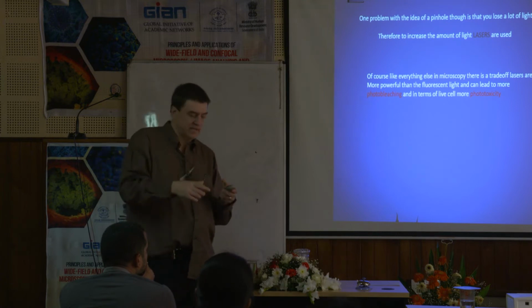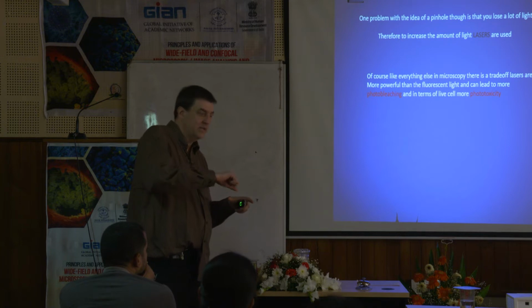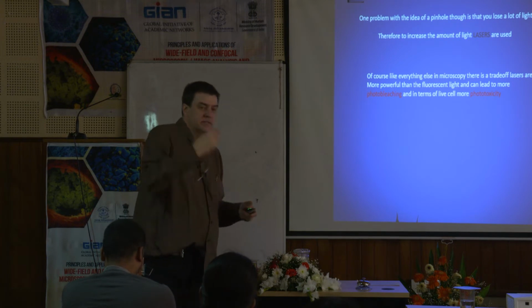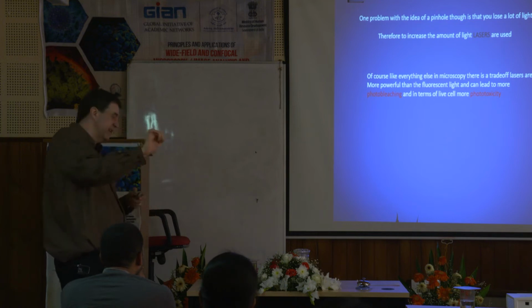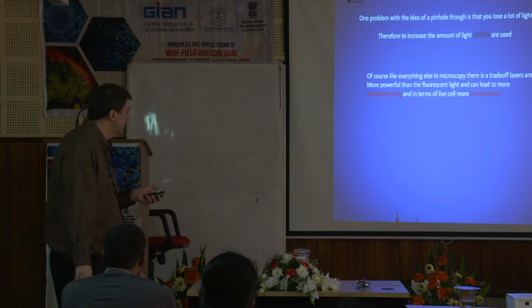Okay, so like if you ever took something colorful and you put bleach on it, right? It just turns it to white. It destroys the color. Same idea here. You're using light to destroy the color. Okay, because the lasers are tough. They're strong. Like they always tell you don't let a laser hit you in the eye. Okay, because it's not a good thing.